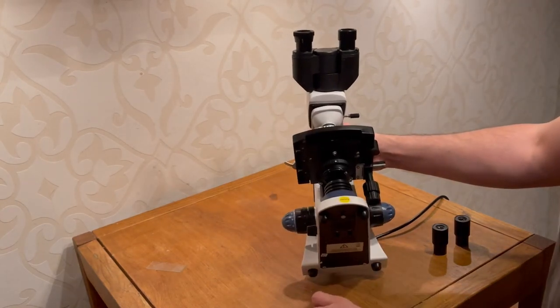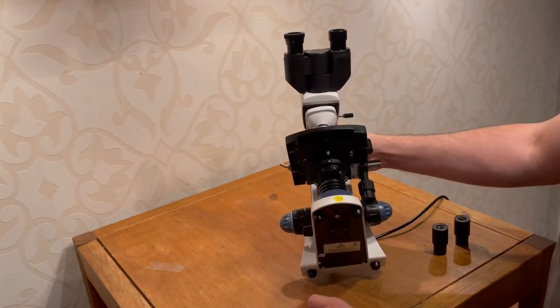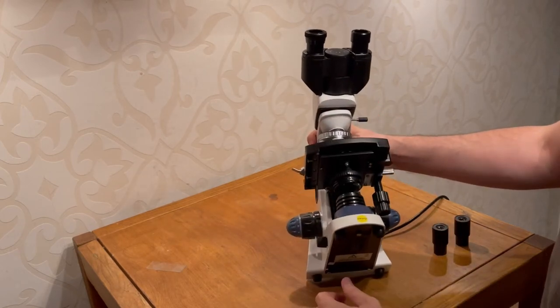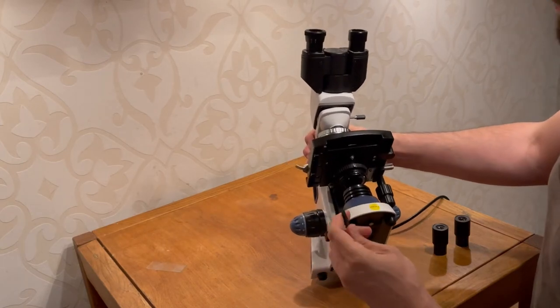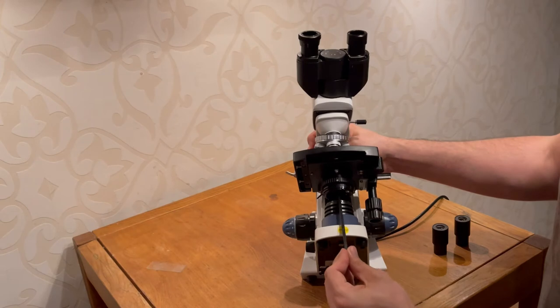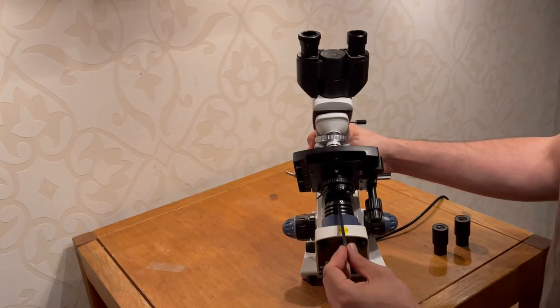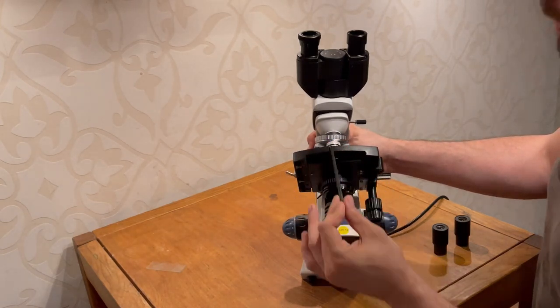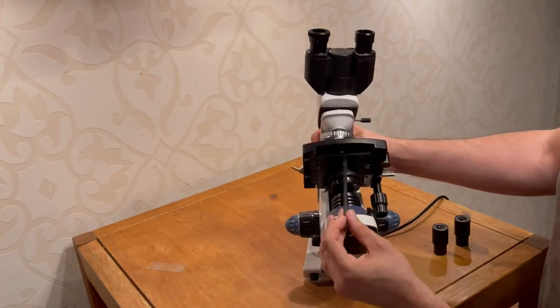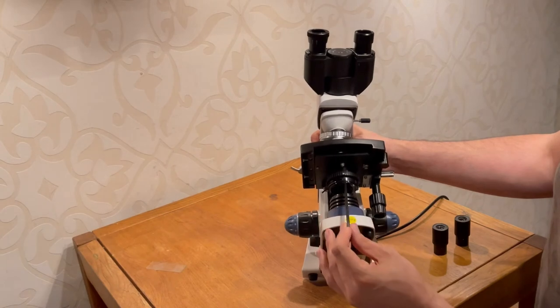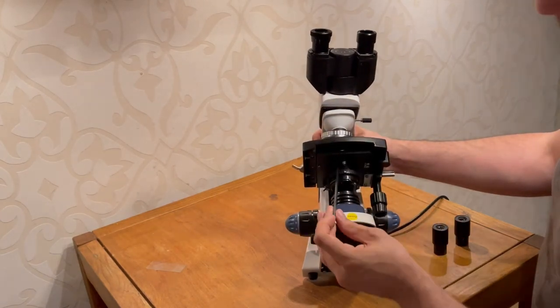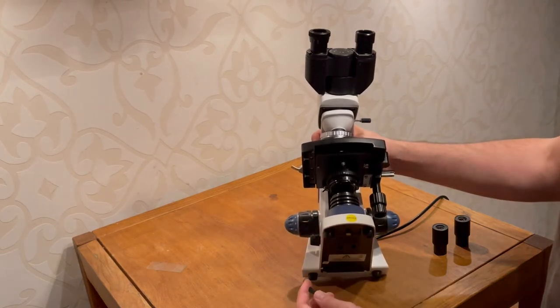It's a bit of a shame. I mean, you're buying something for three, four hundred euro, and then you have these crappy assembly, I think it is. Because as far as I could see, the axis of the LED and the axis of the objective, they are coaxial, they are on the same line. But this whole assembly that transmits the light from the LED, it's not on the same line. It's actually shifted a bit.